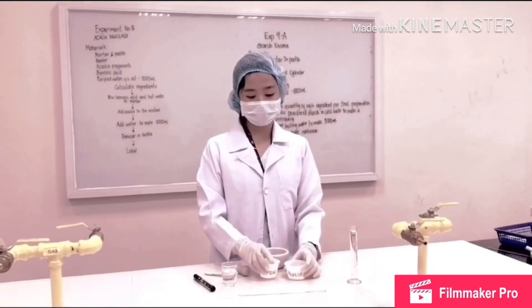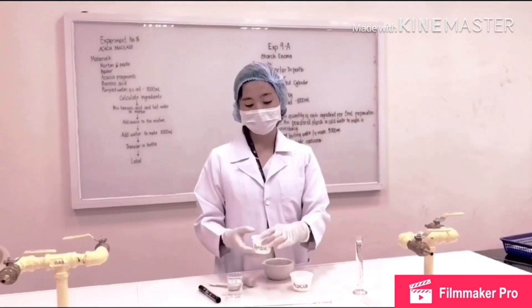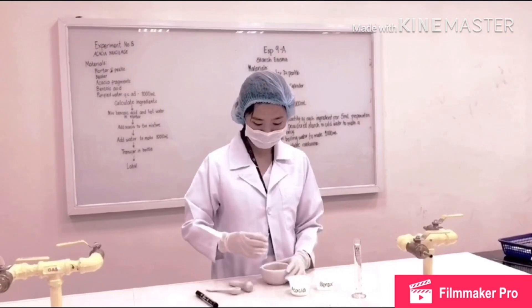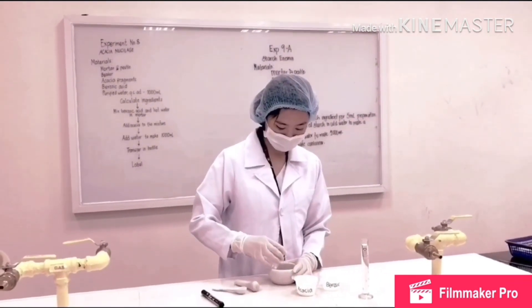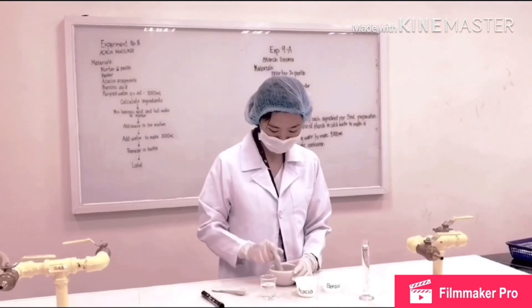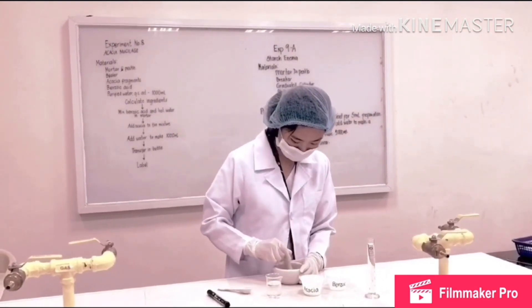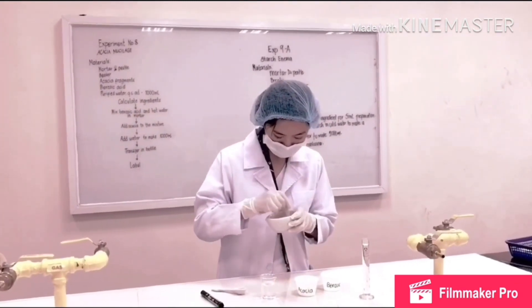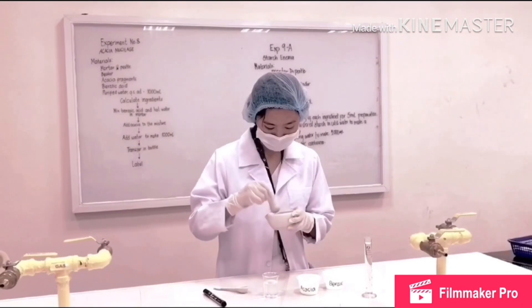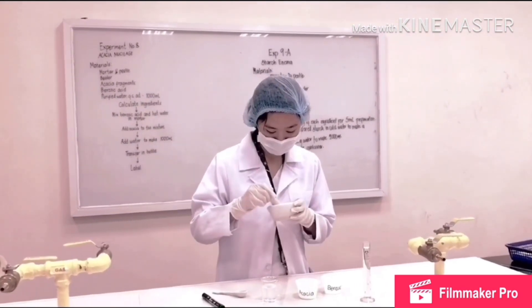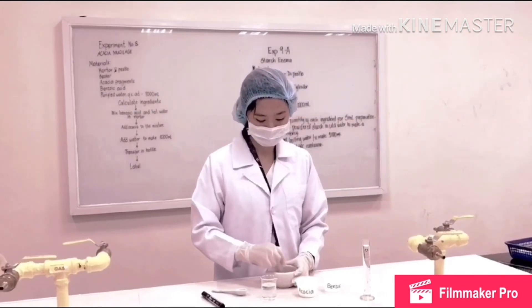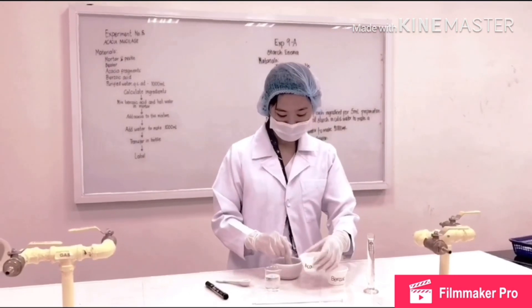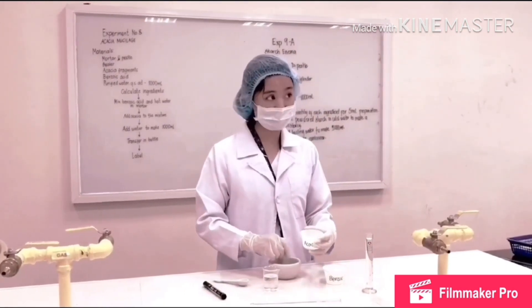We're done calculating the ingredients. So now we will proceed to mixing the benzoic acid with hot water. Third step, we will add the acacia.